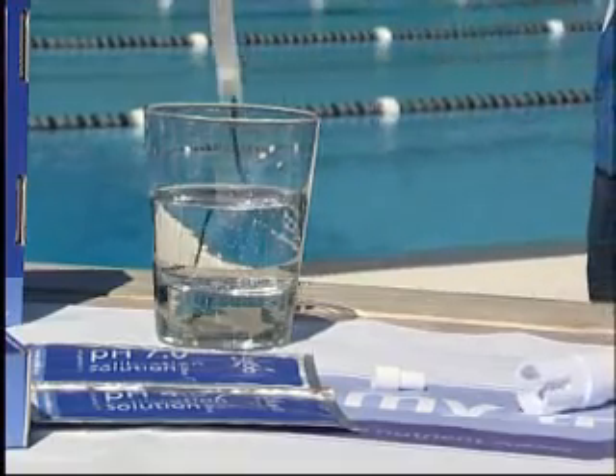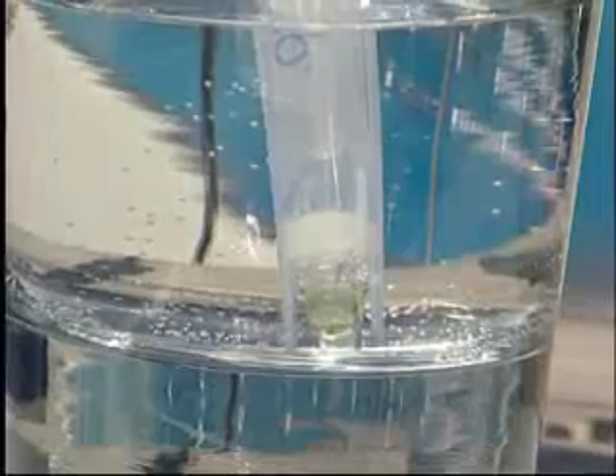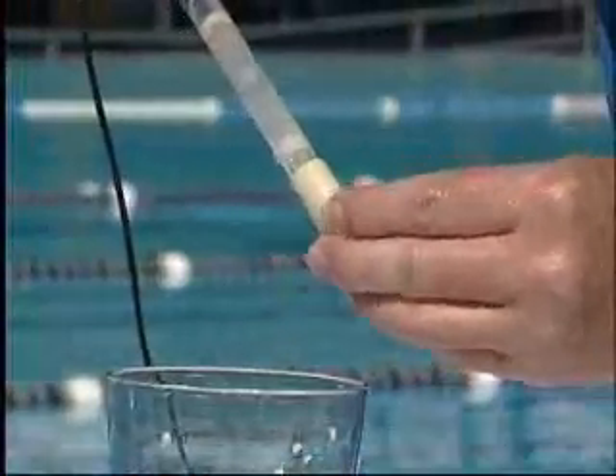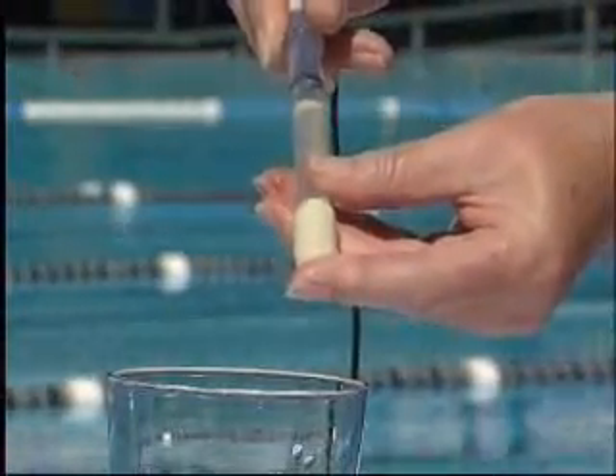When you use the combometer for the first time, the pH probe needs to be hydrated in a glass of fresh water for one hour and will then need to be calibrated. When you have finished using the meter, always ensure there is water in the storage cap and place it back onto the pH probe to ensure the probe tip remains moist. This will prolong the life of the probe.